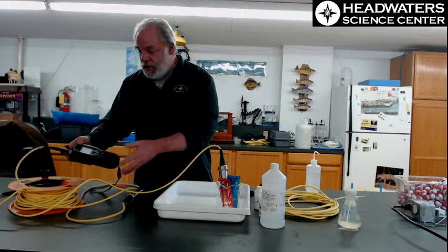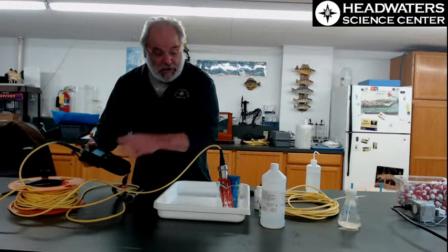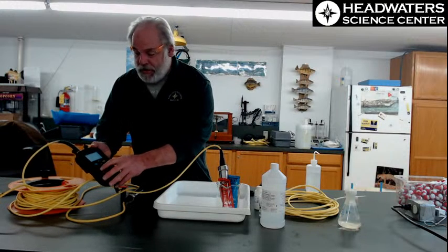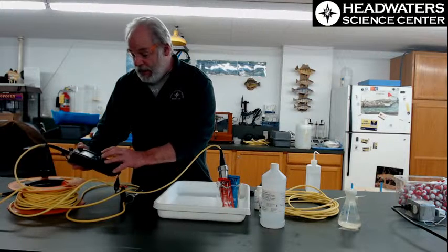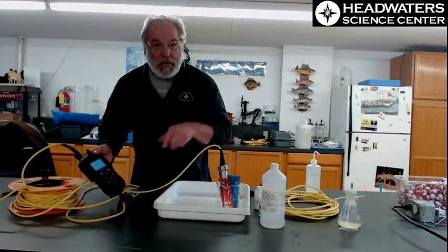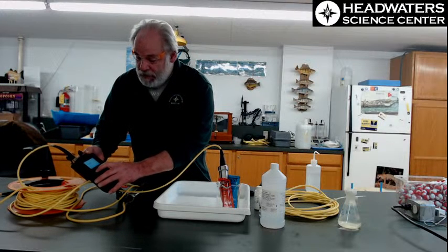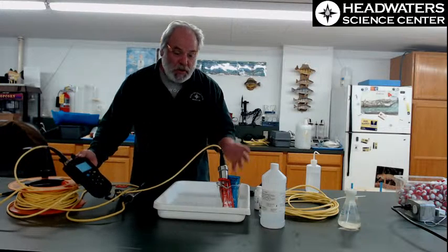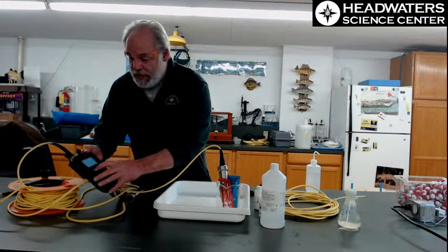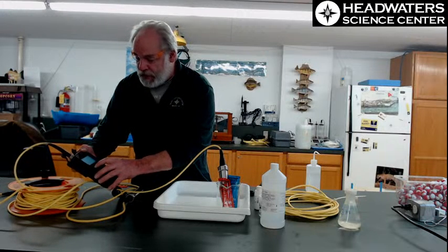So once I'm in the water, now I do a shortcut here, and that is I've already cleaned my probe, and then I do a calibration read. So I'm going to calibrate it from there because I want to get it down to 4.01 or wherever my meter has decided the proper pH would be. pH is related to temperature. It's also related to electrical activity. One thing that can change it is these meters have electrical things that can change.